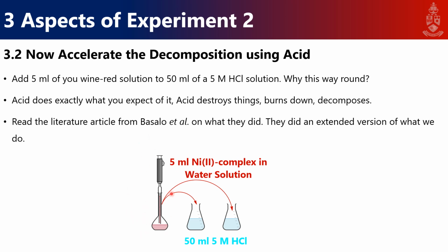Just a note on it, please do use the pipette pump that we provide you with, either the normal pear bulb or the actual pump bulb, as I indicate here. Never suck on a pipette because, of course, you work with HCl, as well as all sorts of germs being around, and there's a whole pandemic. Hopefully you're not watching the same video in 2075. Or hopefully I'm not presenting this course in 2075 still. Anyway, that's the point of the slide.